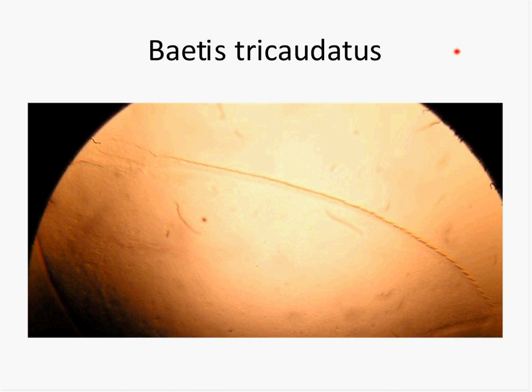But they're much easier to see under the compound microscope, and even though it sounds like an onerous step to pull the gill and wet mount it, I found that it actually saves you a lot more time than trying to manipulate your specimen and manipulate your light to see the shine of the spines.